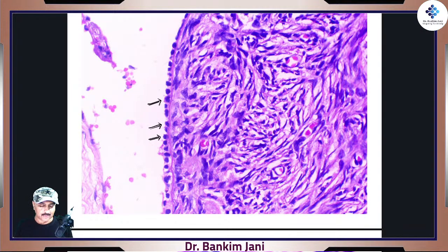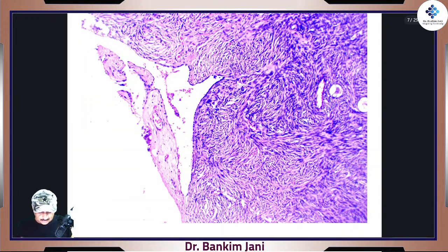Perfect ovarian surface. See, I was talking about this area, right? This one. This is the surface. This is all inside. Right now, we don't want to talk about it. Only the surface. Right. That's the surface.